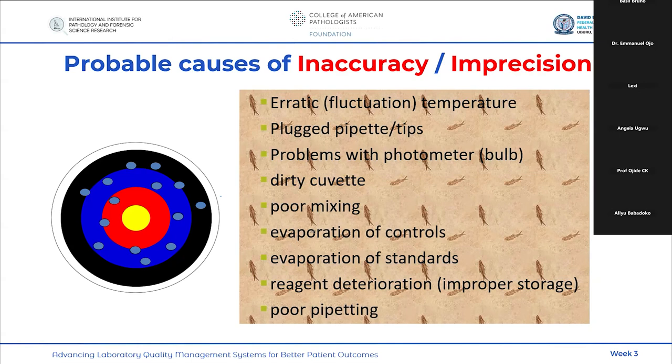And we've seen cases where QC failure has been traced to a lack of calibration of pipettes. What it means is, especially for all these lyophilized quality control materials, when you are meant to pick a particular volume of diluent, if the pipette is not calibrated, it will over dilute or under dilute the control material in the lyophilized form.